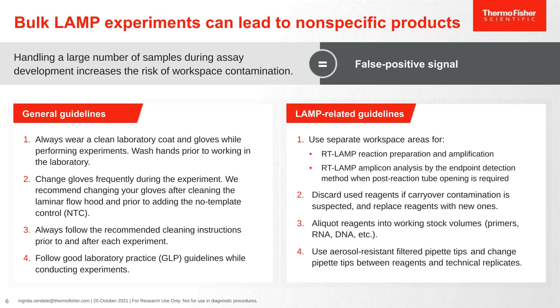Aliquot your reagents into working stock volumes, such as aliquoting primers or your RNA, DNA targets or internal controls, is good practice. And always use filtered pipette tips, and of course change your pipette tips between your technical replicates.